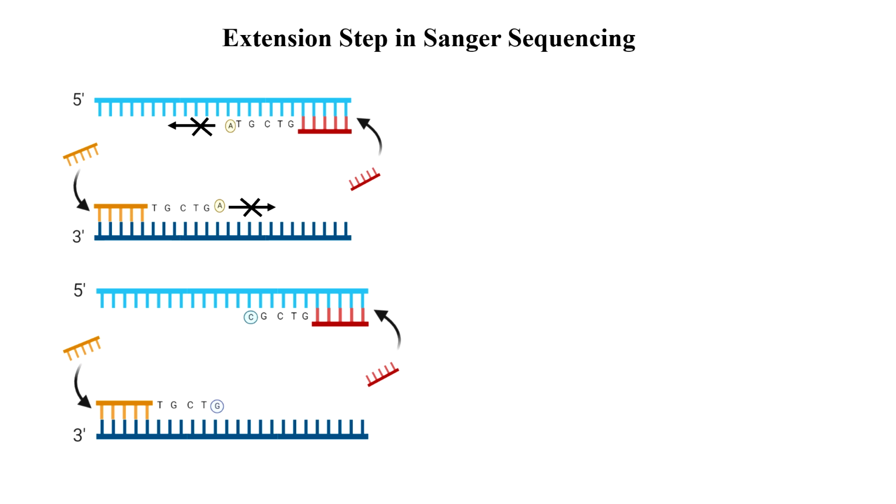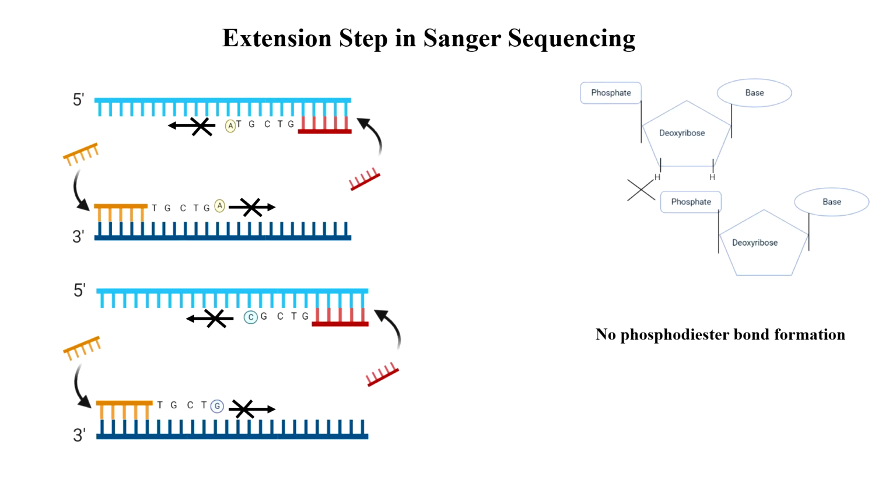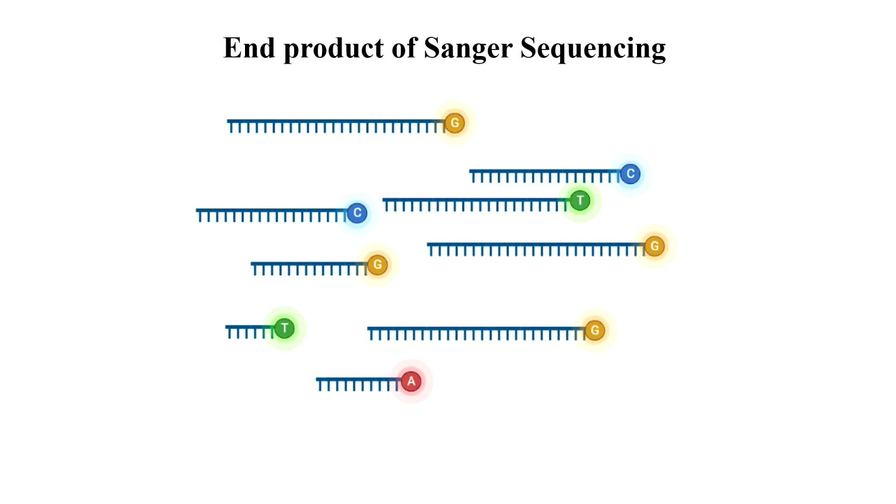Here the Taq DNA polymerase cannot distinguish between dNTPs and ddNTPs. So every time ddNTPs come, termination of the chain reaction occurs. This is the reason why it is called the chain termination reaction. Now, the end product of sequencing PCR or the Sanger sequencing method is different lengths of DNA ending with fluorescent labeled dideoxynucleotide. Here you can see different DNA fragments are present.